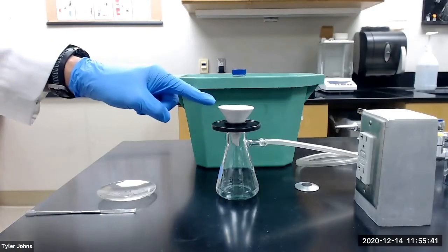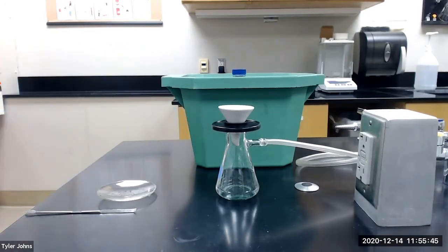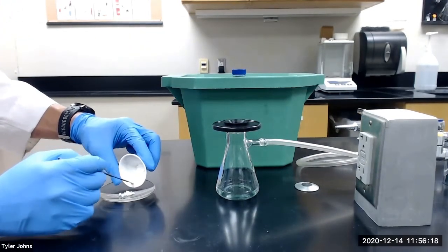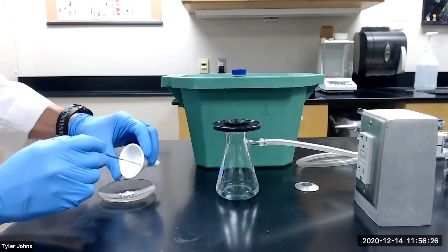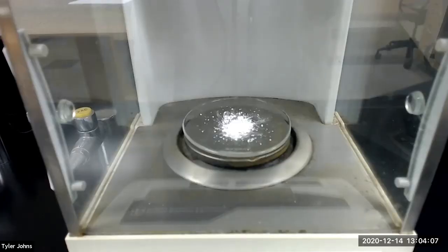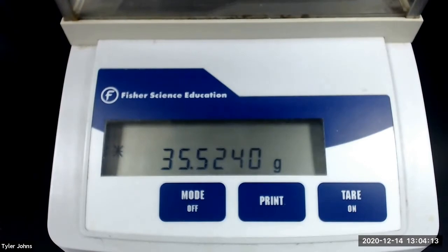We will next collect the benzylic acid on the pre-weighed watch glass and then dry for several minutes in an 80 degrees Celsius oven. After drying, the mass of the pre-weighed watch glass and the benzylic acid is 35.5240 grams.